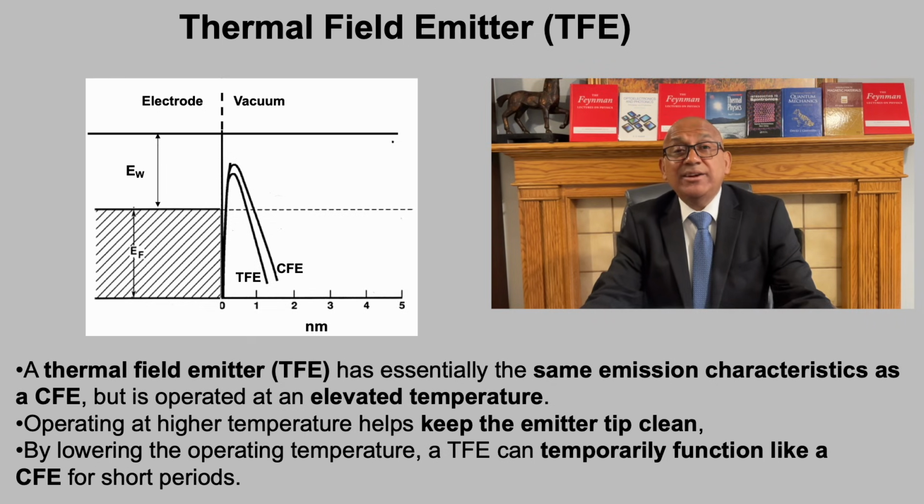An important point is that a TFE can also be operated for short periods in a cold field emission mode by lowering the temperature. This flexibility makes TFEs particularly attractive for practical SEM operation, offering a balance between performance and robustness.